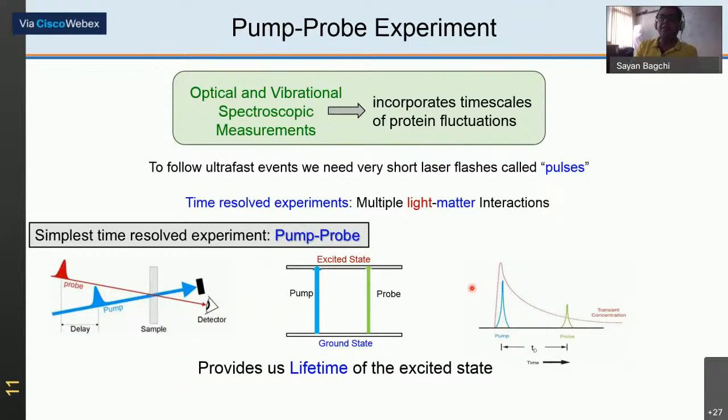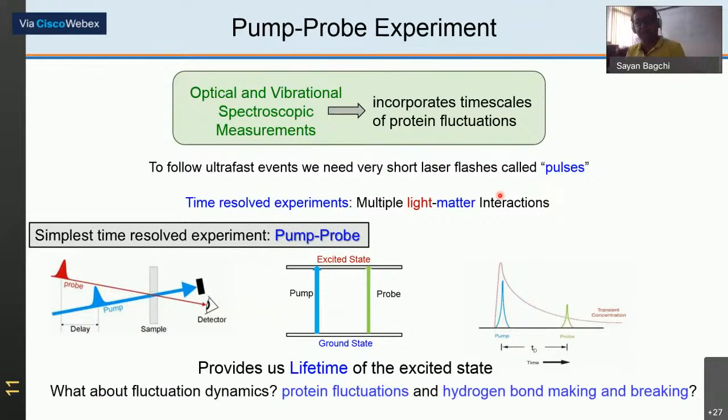So this is the easiest time resolved experiment we can think of, and depending on how short we are making these laser flashes, we can do a pump probe experiment in nanosecond time scales, picosecond time scales, femtosecond time scales, depending on if we have nanosecond pulses, picosecond pulses, femtosecond pulses. But this lifetime is an inherent property of the molecule.